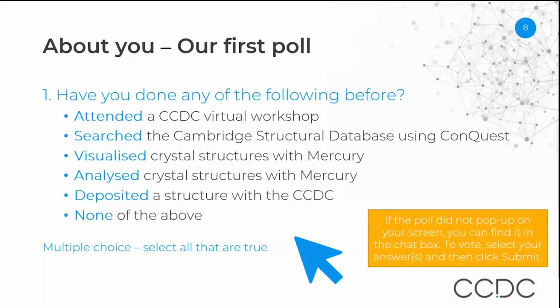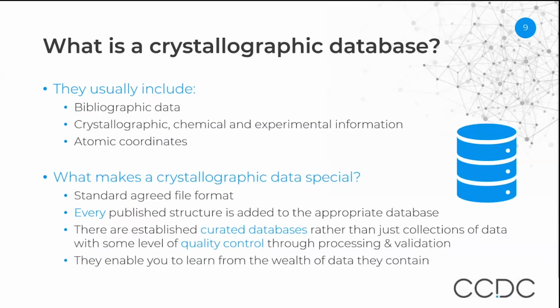And a few of you have also deposited a structure with the CCDC. So while you're navigating your way to our poll and completing that, let's go back to the foundation of everything we'll look at today, and that's a crystallographic database.